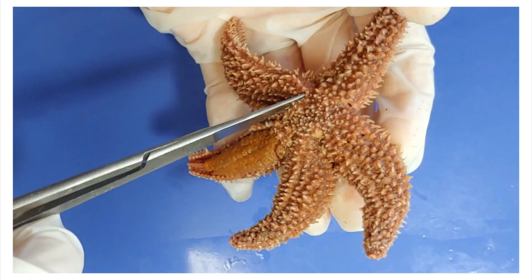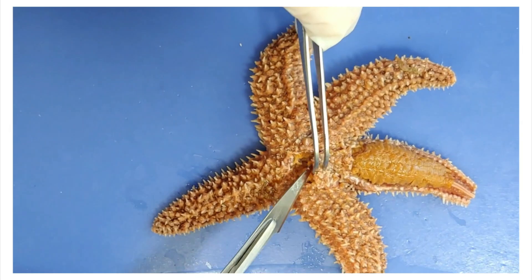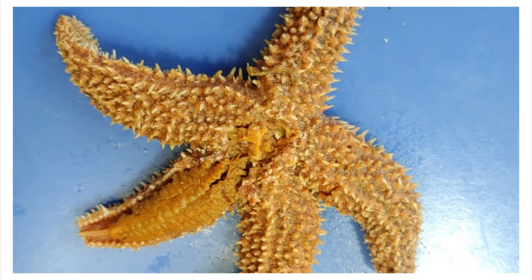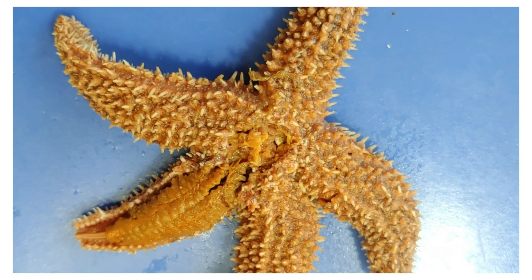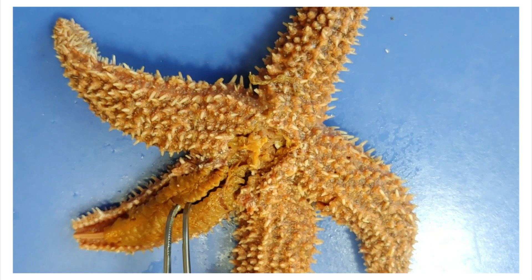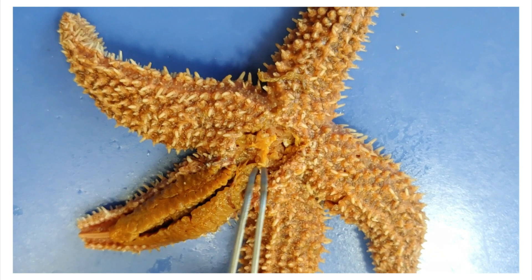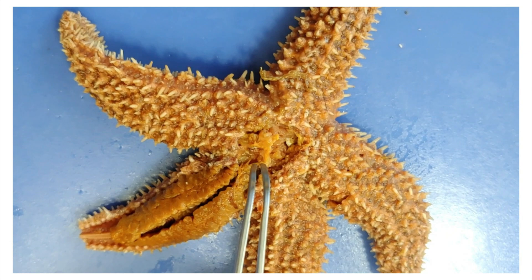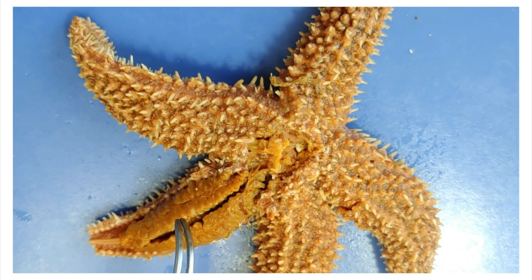Now I'm going to cut around the central disc, being careful to avoid cutting the madreporite. Lift up the flap of skin and use the scalpel to dislodge it. This structure here is the stomach — fun reminder: sea stars throw up their stomach to eat. The stomach is connected to structures in each of the sea star's radial arms called the digestive glands; there are two in each arm. These produce digestive enzymes and send them to the stomach, where the food is partially digested externally before the soup-like chowder is drawn back into the digestive glands where the nutrients are absorbed. This allows much of the digestion to happen outside the body, so it can eat larger prey.